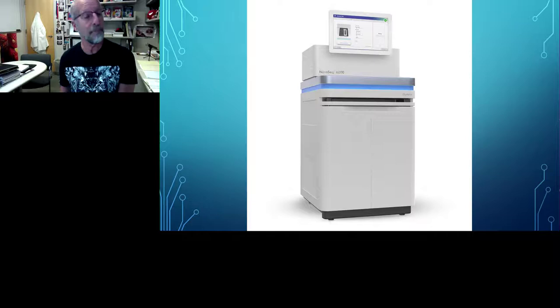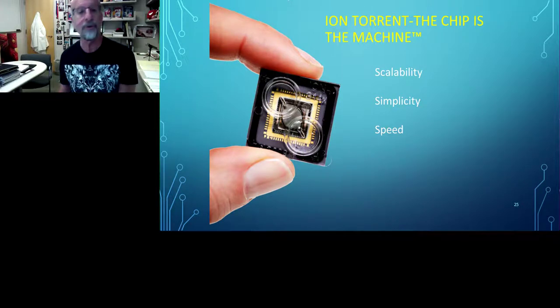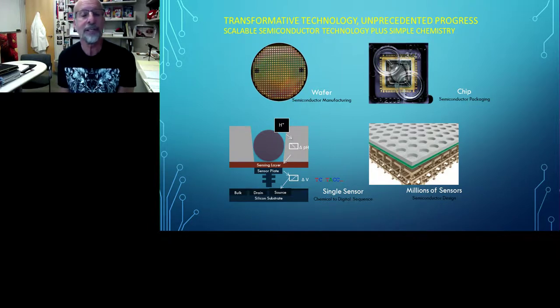Now, there are a couple of other competing platforms. One of them is a company called TORRENT, and TORRENT does a completely different type of sequencing. They do sequencing on a tiny little chip that looks almost identical to a computer chip, because that's indeed how it's made. What the TORRENT chip, however, is, instead of an electronic computer chip, shown on the bottom right, is basically millions of tiny little wells, but each well is a sensor. They're linked up and tied to basically a pH meter, and it's important because every single time a nucleotide is incorporated, a hydrogen ion is released.